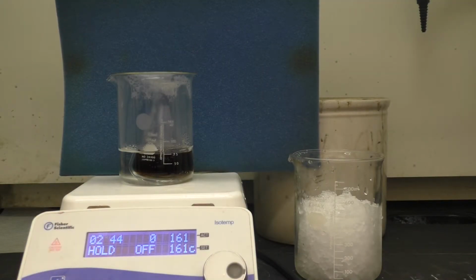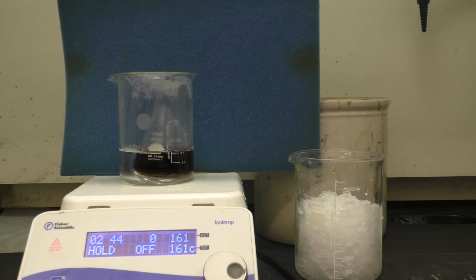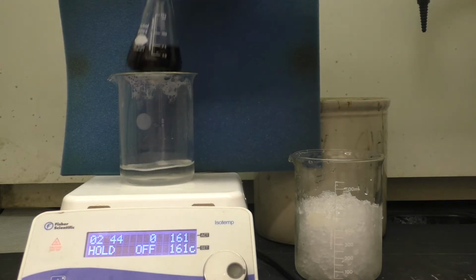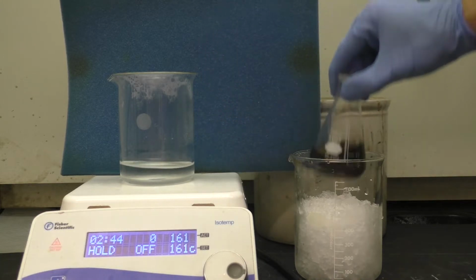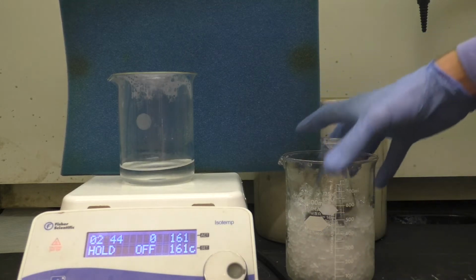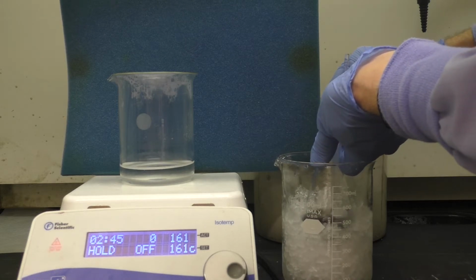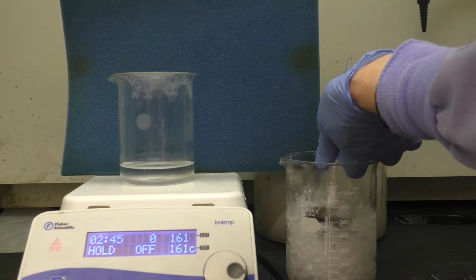Now that we've let the reaction stir for at least 10 minutes here in the warm water bath, we're going to remove this and place it directly into an ice bath and try to scrape the sides of the vial to induce crystallization, try to get material to come out of solution here. So we'll go ahead and do that now. Move this out, swirl it and bury it here in the ice bath. And then we'll begin to scrape, see if we can get any kind of solid material to come back out of solution.